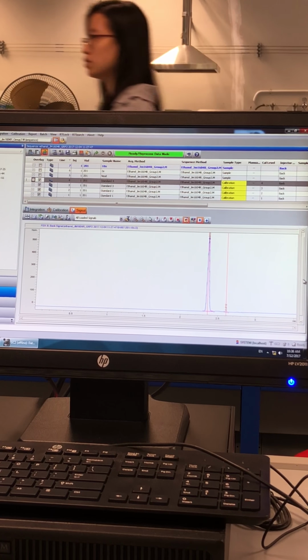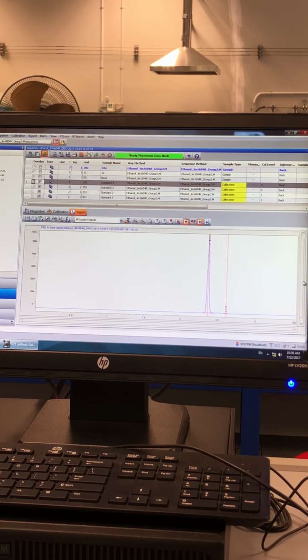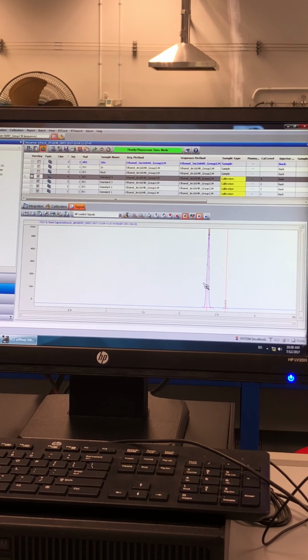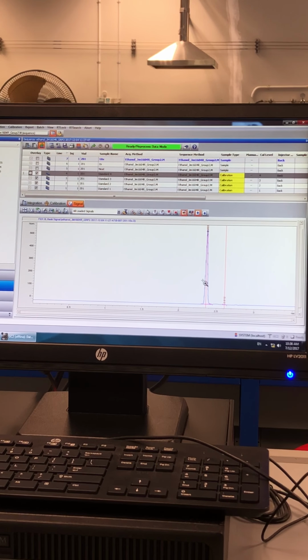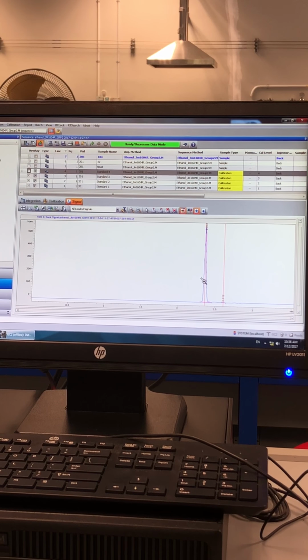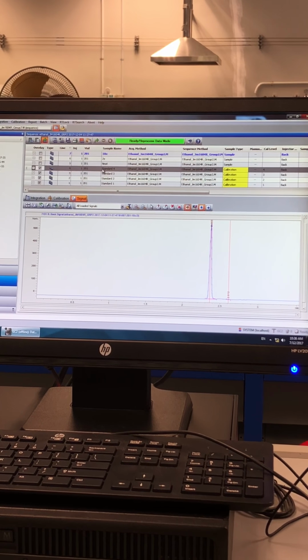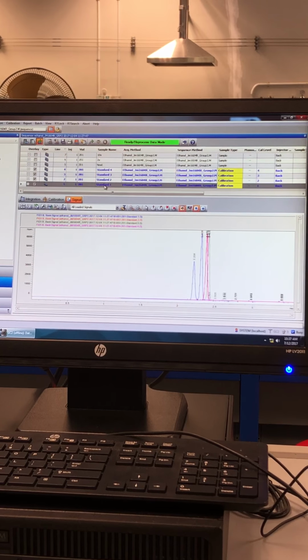After you've done that, have you all ticked already? All the calibration files, the 4 standards. Then double click on any of the standards.